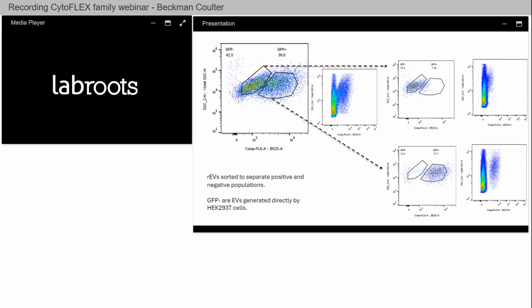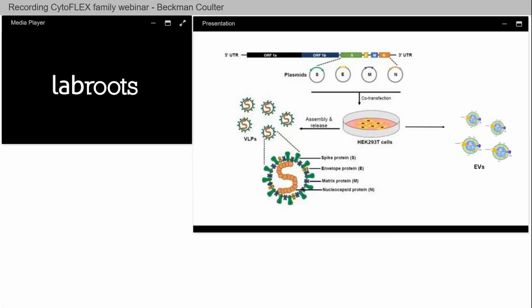Why not, right? This is the whole point of all of this, to show that we could sort and maybe garner information from these subpopulations that we didn't know about before, and just to advance the science, right? I mean, some of this is just us having fun, and trying to understand better. So you can see here, we can isolate the two, and then it hit us. Well, okay, maybe it didn't hit us.